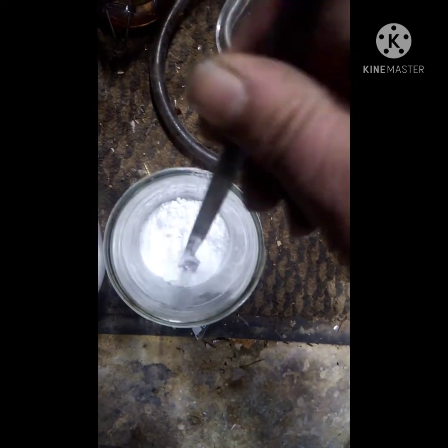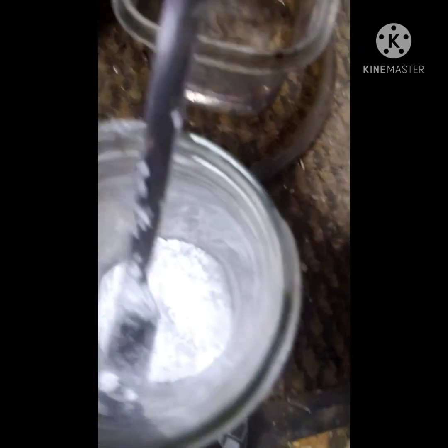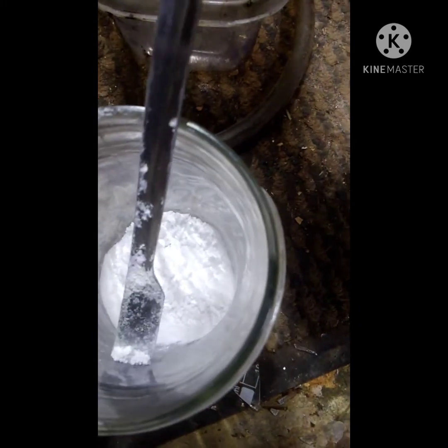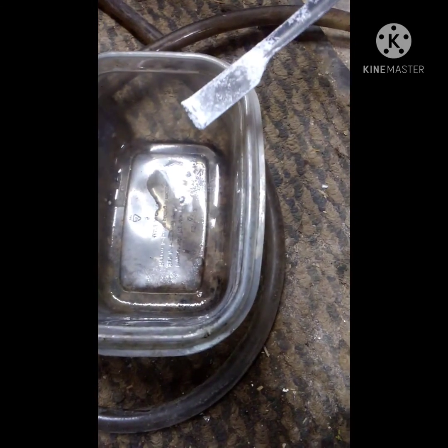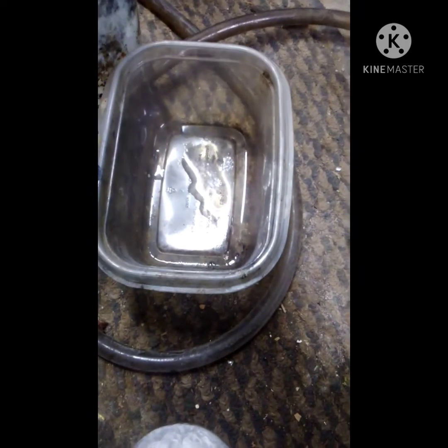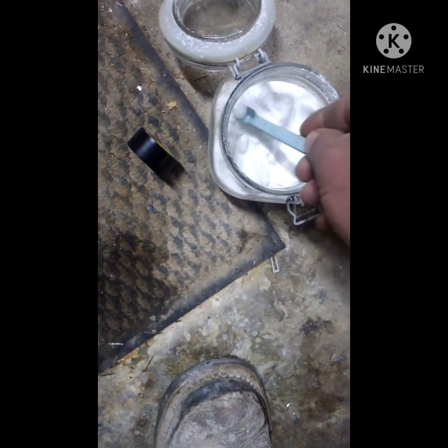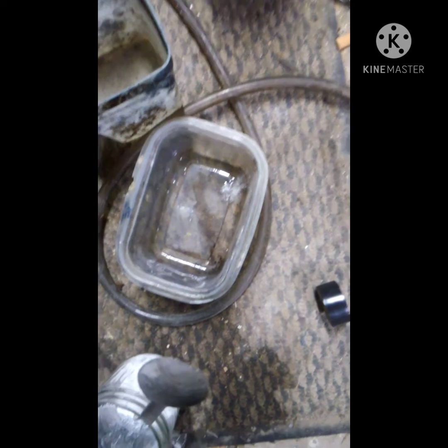It's definitely done. Just to show you what it does in water — pretty reactive. And here is regular sodium borohydride for comparison. It still reacts, but not nearly as well.